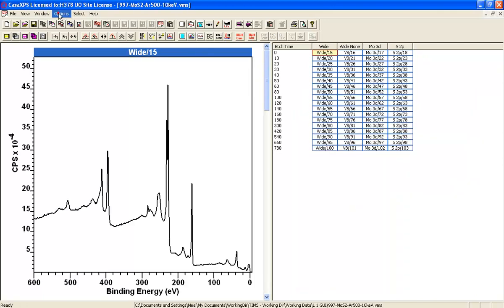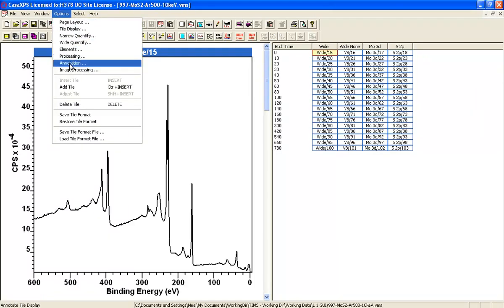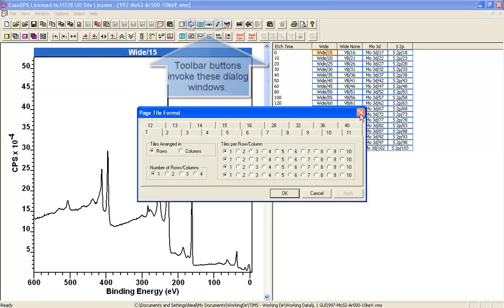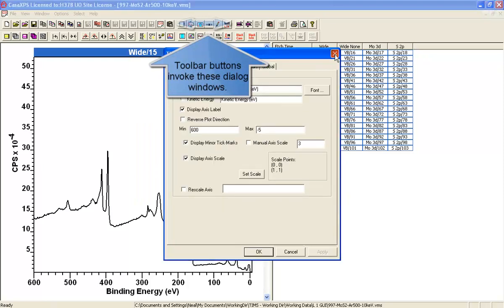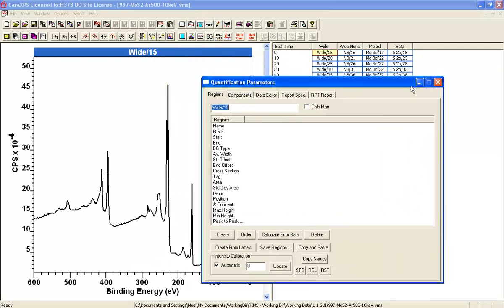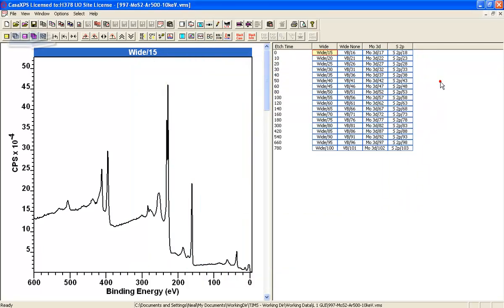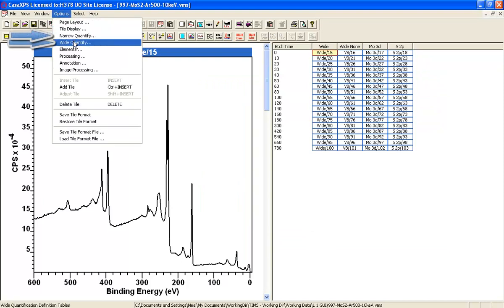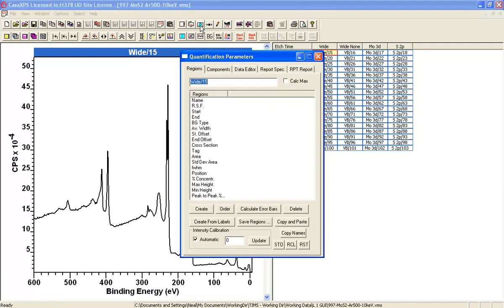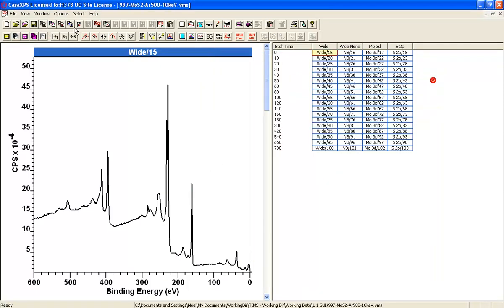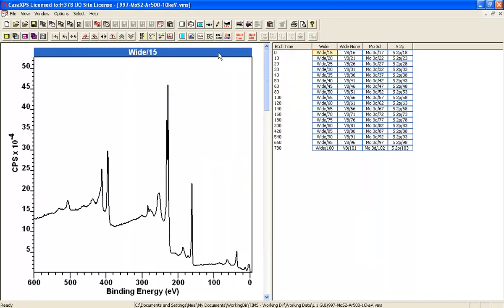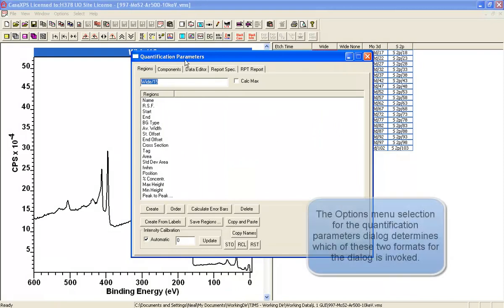These primary options on the options menu are also available from a set of toolbar buttons. The quantification parameters dialog window will come up in the format previously selected from the options menu. So if I select narrow and close this window and then select from the toolbar it'll come up with the narrow one. However, if I select the wide one from the options menu and then at a later time select from the toolbar, it's the wide one that comes up.